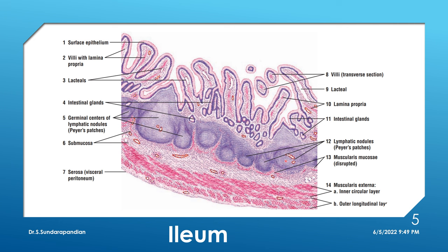In the slide of duodenum and jejunum there may be a chance of lymphatic nodules in the lamina propria, but usually there are no nodules. In ileum the striking identification point is the presence of numerous lymphatic nodules called Peyer's patches — which are aggregations of lymphatic nodules. The number of villi in ileum will be less and smaller in size compared to jejunum and duodenum.